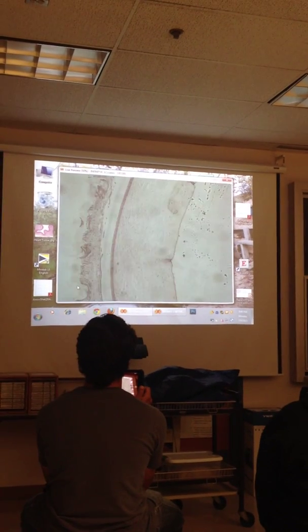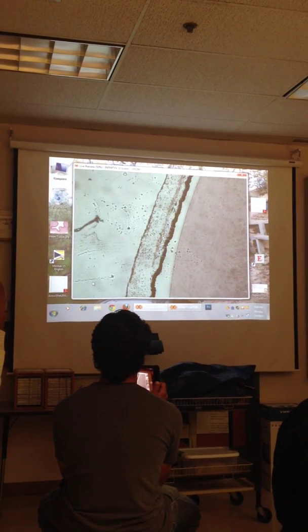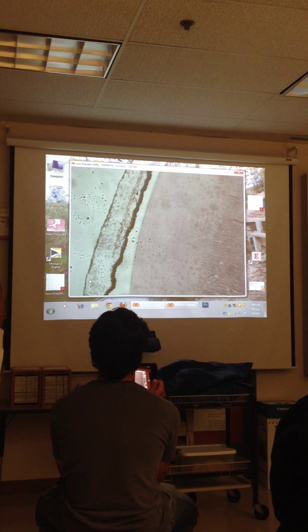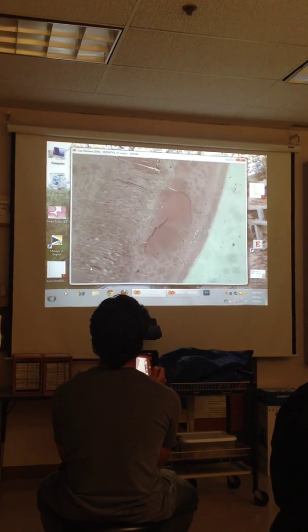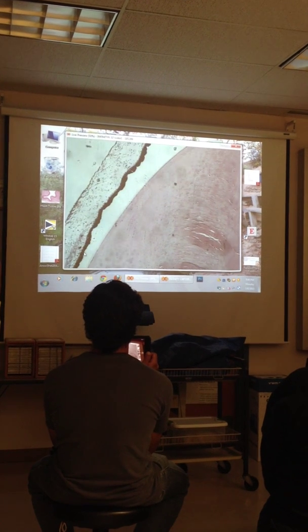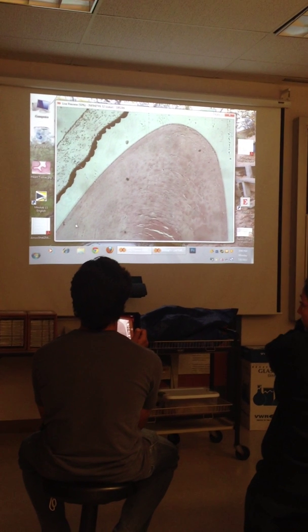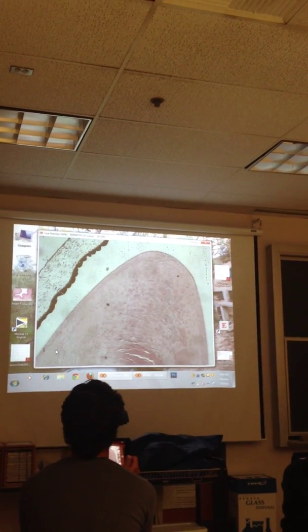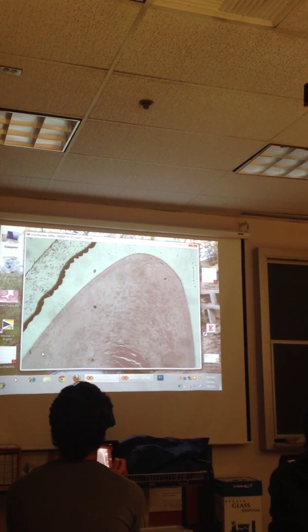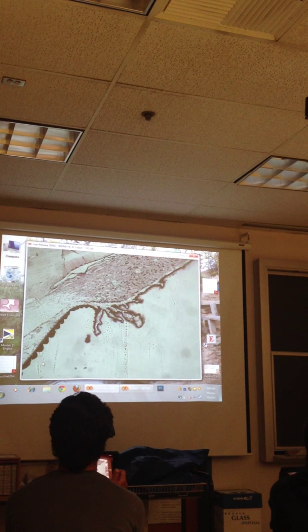So again, you see the cornea. We go back. First thing you should run into is the iris, which is usually going to be pretty thin, and then the lens that you can see all the way through there. See a little bit of the striation in the tissue. When you cut the lens so thin, it tears apart like tissue paper. So on some slides, you'll see these pink torn tissue paper bits. Those are just part of the lens that shredded and tore apart there. And again, you see ciliary body up here towards the top.